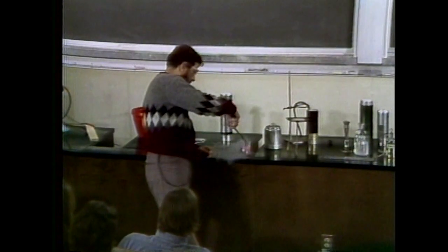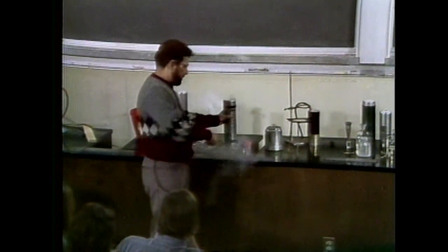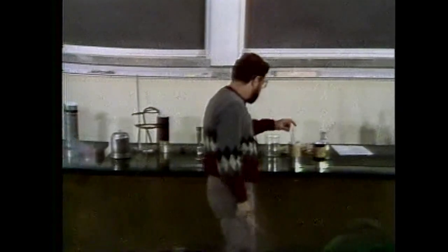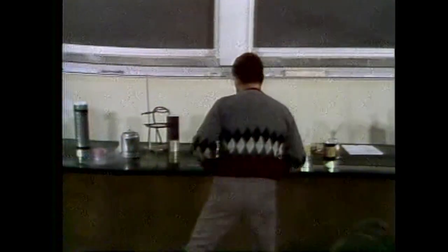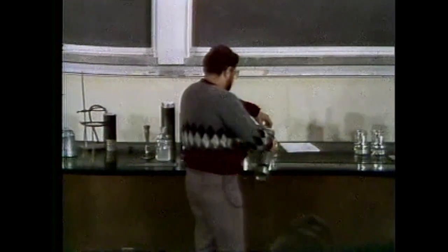That's because the rate at which the gas is escaping is relatively high. And it's also pretty cold in there. So maybe I'll use this thing here. Let it go. Let's see what's happening with these two here. Well, not much is happening here, so we ought to help it along a little bit.